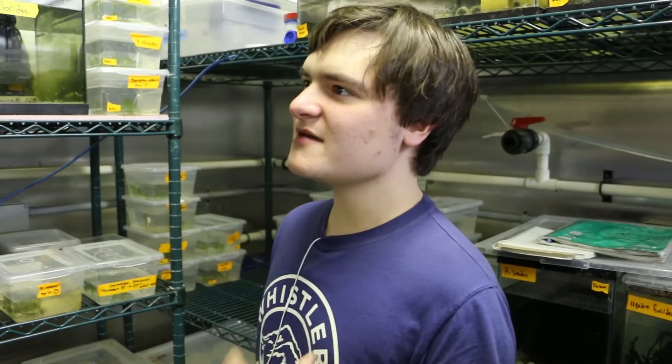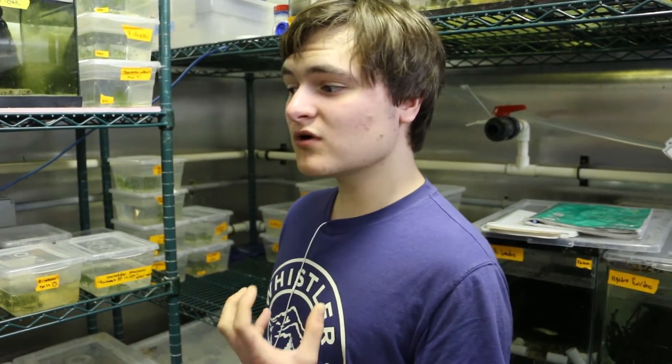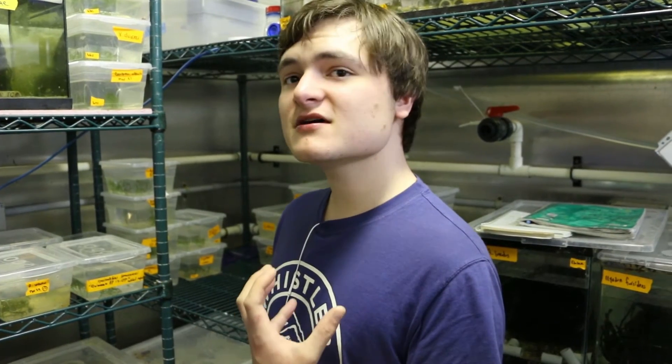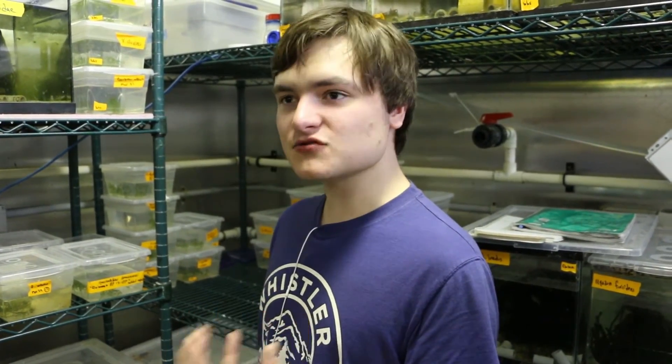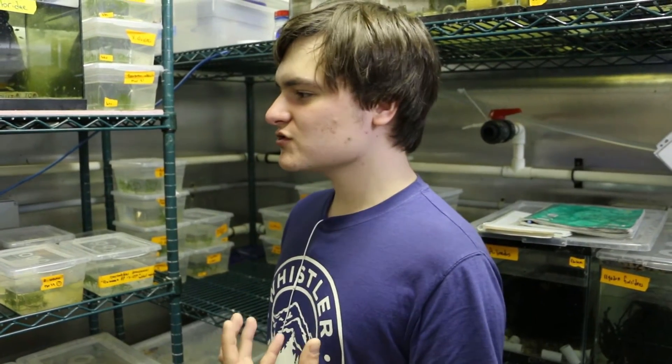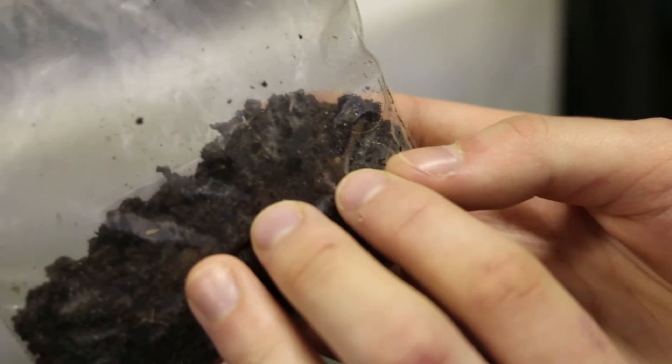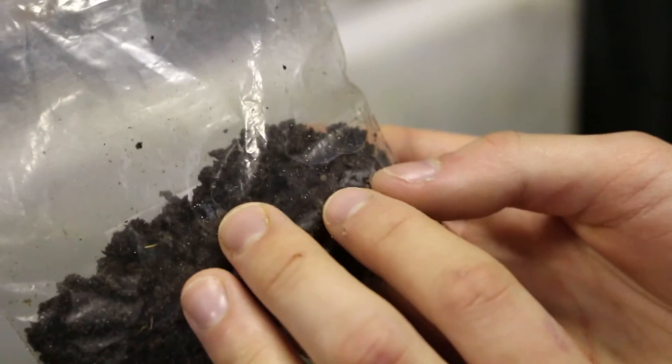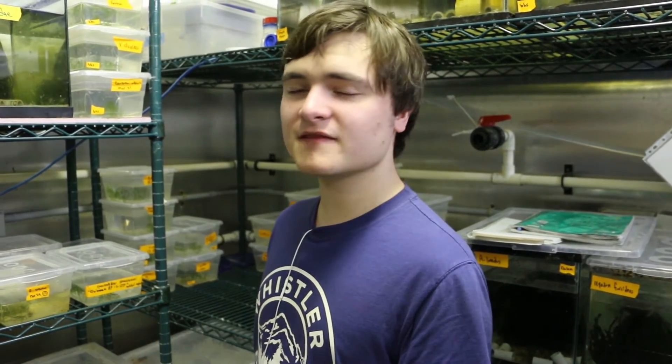A lot of these fish came into the ACMA lab as eggs because annual killifish, one of the defining characteristics of them is they are able to dry out as eggs and still survive and hatch. So they got shipped here to the ACMA lab in substrate in a bag from different researchers or different fish breeders. And then once they got here to the ACMA lab, I put them in some water and then they hatched out.